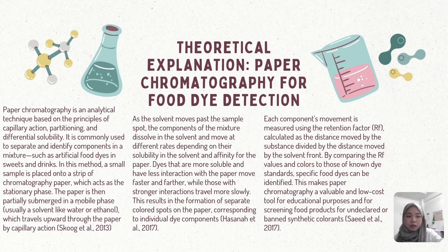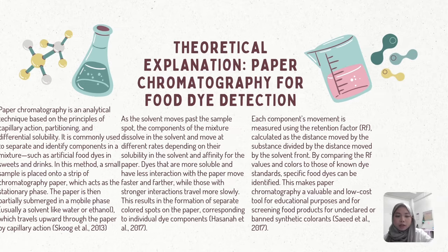By comparing the Rf values and colors to those of known dye standards, specific food dyes can be identified. This makes paper chromatography a valuable and low-cost tool for educational purposes and for screening food products for undeclared or banned synthetic coloring.